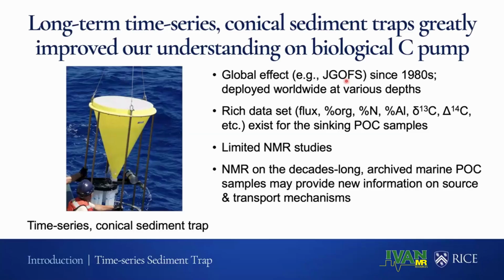However, surprisingly limited NMR study has been done for these valuable POC samples. NMR measurement can directly report the chemical composition of the POC, and we think NMR on this decades-long archived marine POC samples will improve our understanding of the source and the transport mechanism of POC in marine systems.